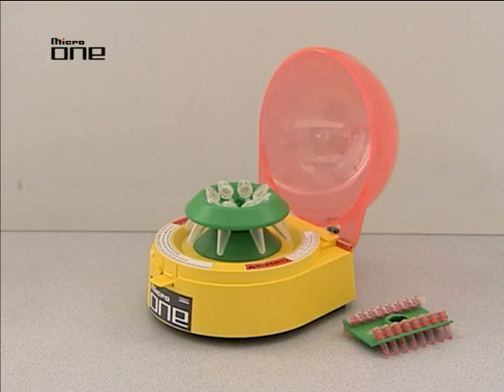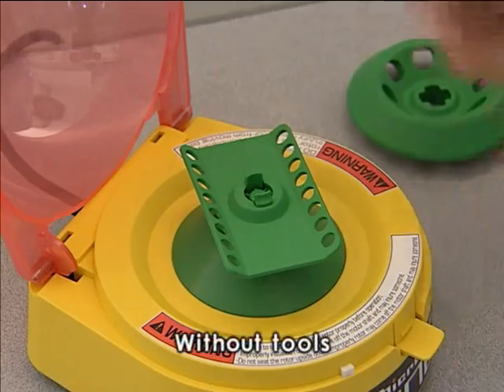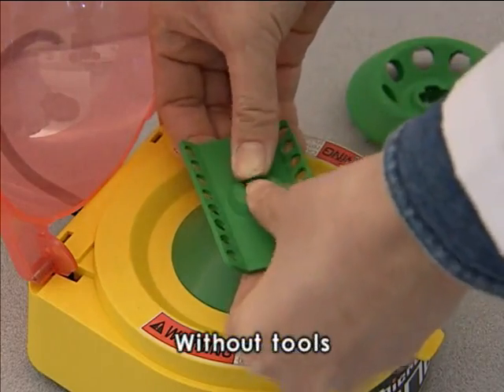Two types of rotors — the PCO8 strip tube rotor and the micro tube rotor — can be directly mounted without the need of tools. Now I'll show you how to replace the PCO8 strip tube rotor with the micro tube rotor.